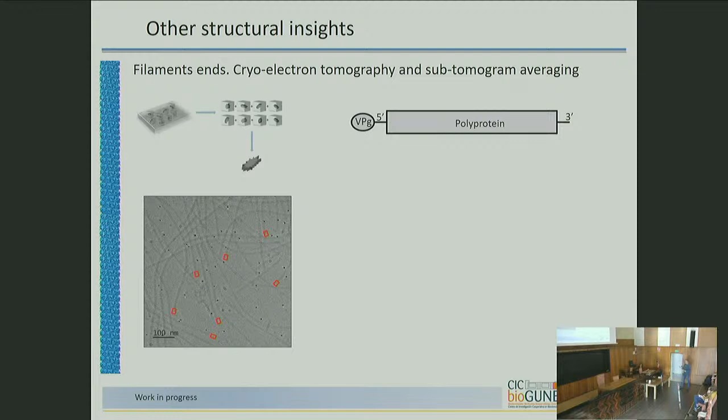But the idea is, in this case, for Potyvirus, which is really relevant, as I mentioned, they are all outsiders here. They have a VPg protein linked to the 5' end, a poly A tail at the 3' that I didn't put here, and they code for a polyprotein that is processed later. They are more like the picornavirus-like group of viruses, because of this genome structure, or the strategy they follow, the presence of the protein. And we chose that because if it has a protein on one side, maybe we are lucky and we can see something there. So the idea is that you do tomography, make a tilt series, and align them.